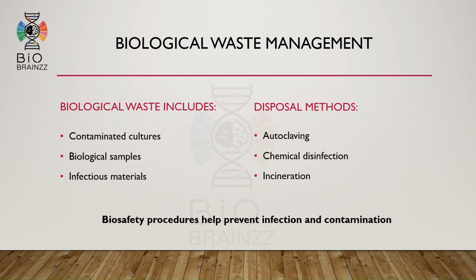Biological waste includes contaminated cultures, infectious materials, and biological samples. These materials may contain harmful microorganisms and therefore require special disposal procedures. Common disposal methods include autoclaving, chemical disinfection, and incineration. Proper biosafety practices help prevent infection and contamination.